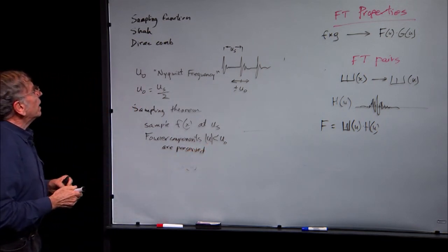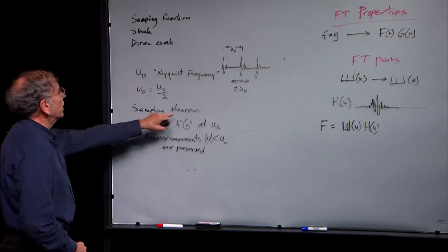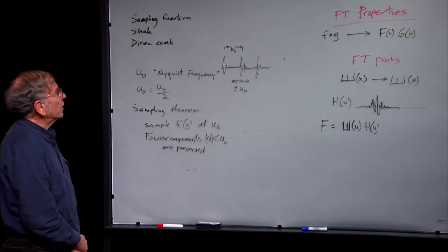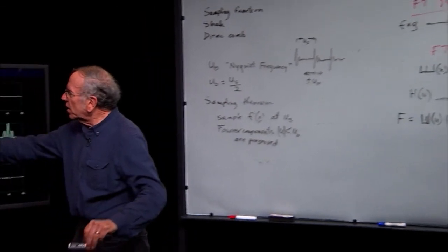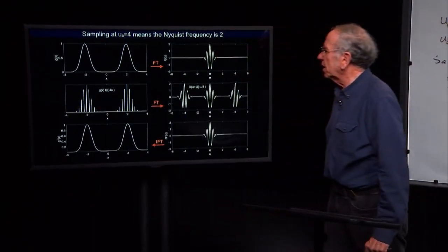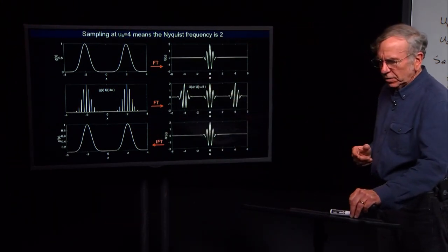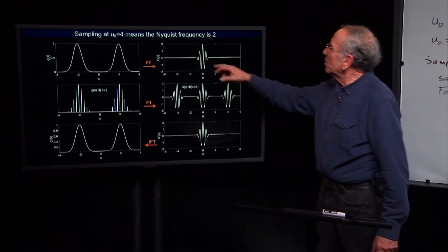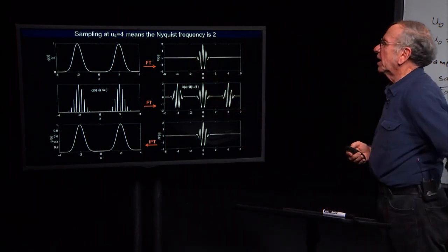This was first noticed by Harry Nyquist in the 1920s, and the sampling theorem now goes by the name of the Shannon-Nyquist sampling theorem, and it's actually a remarkable result. It says that you give me relatively sparse values of a function, and I can, by doing these tricks, reconstruct the original smooth function, with the only caveat being that the smooth function has to have no Fourier components too far out.